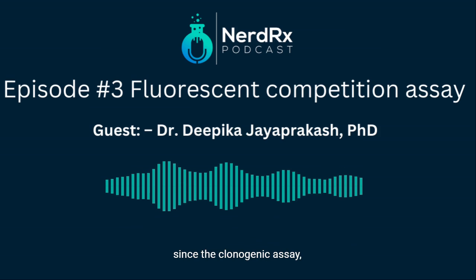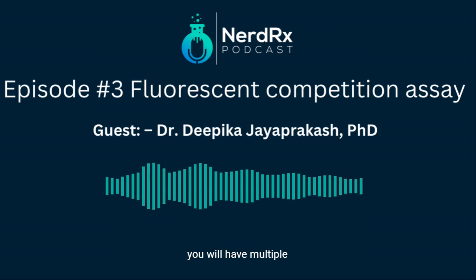Since in the clonogenic assay you will have multiple controls, controlling for the seeding density, controlling for the gene, that's one of the huge advantages I see here.